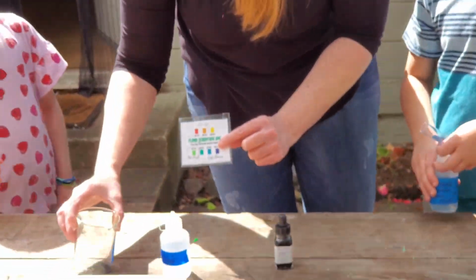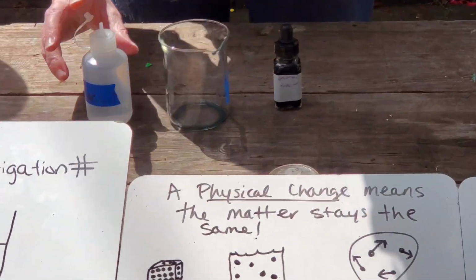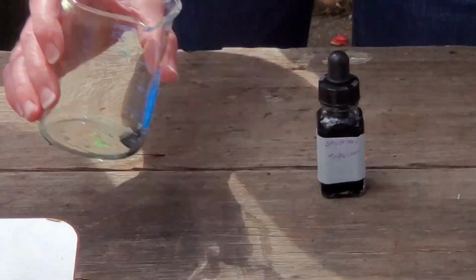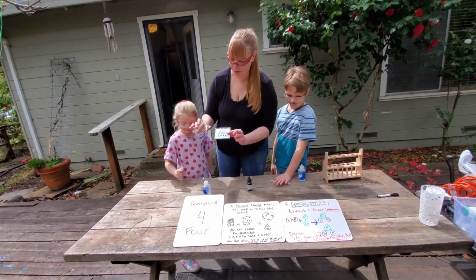Okay, there we go. Green. So I don't know if you can see that. That's green. Wait, let's do a little bit more of the vinegar. Good thing I have you guys. I wouldn't know what I was doing. All right, there we go. We're just trying to get, like Jewel said, we're trying to get green, okay?